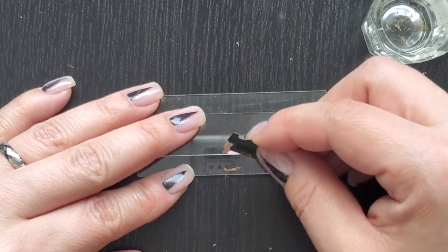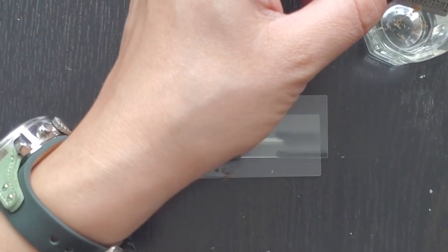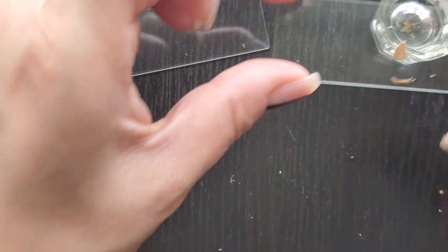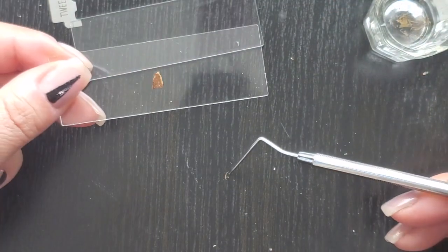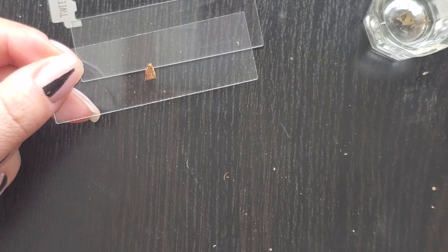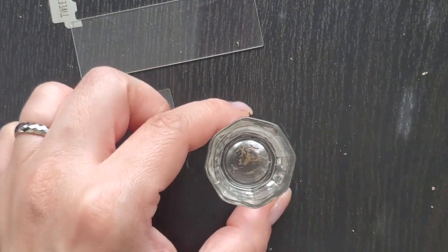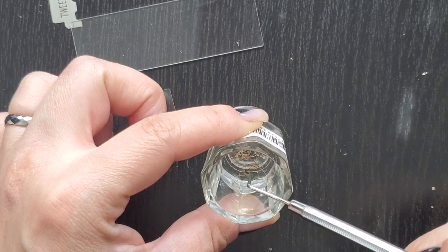The other reason I like this method is because you're not wasting the blade on styrofoam. I mean, sure, you're going onto glass, which will dull your blade anyway eventually, but here's a trick to pick up pieces. You moisten the tip of your needle and you just touch and go. Maybe there's something in here that I like. There's some in here that I like.